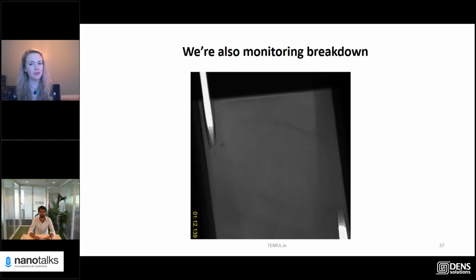However, if I make a FIB lamella and there are no charged walls in there, I'll just cycle it a bunch of times, and with luck, depending on the ramp, the drop down of the temperature, sometimes you can form really interesting patterns. That's why I would do that.